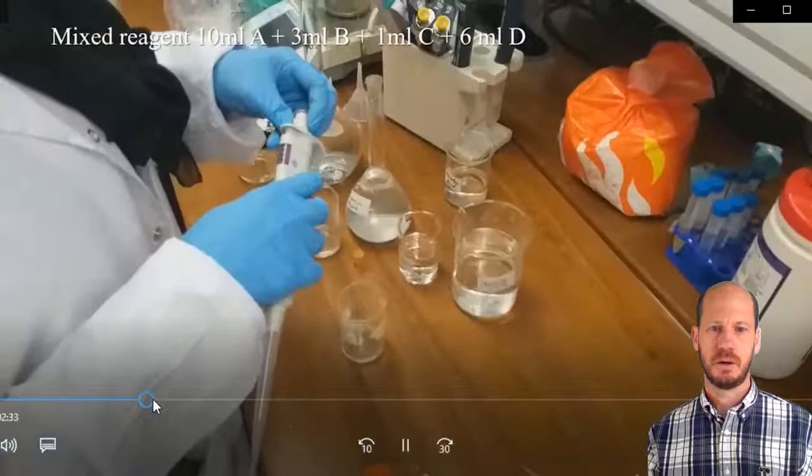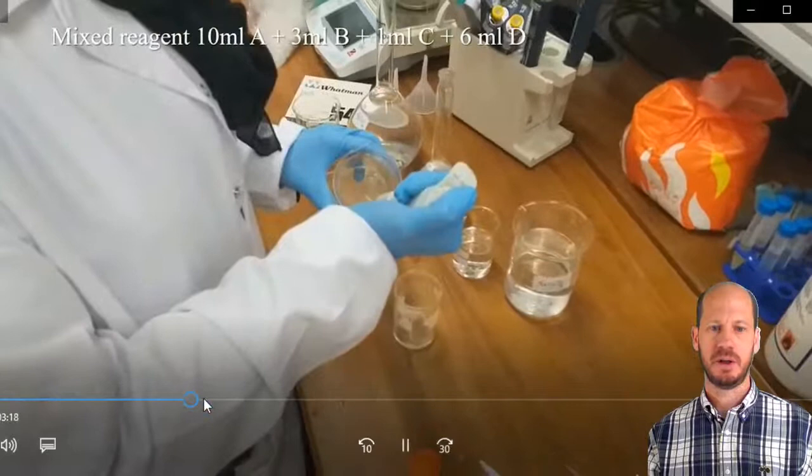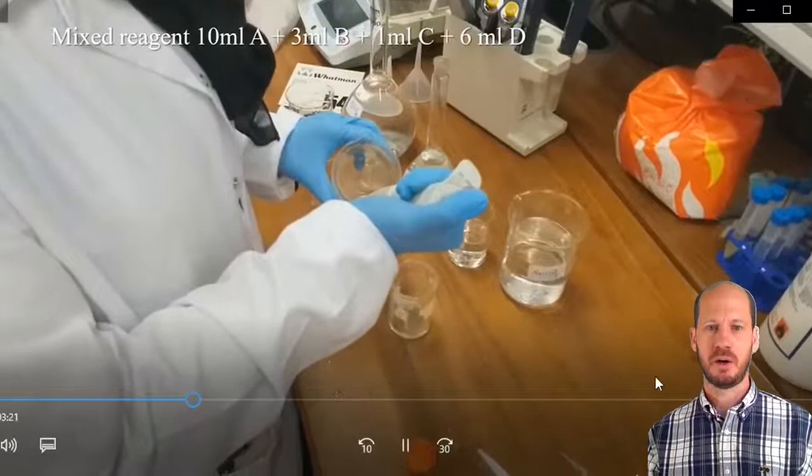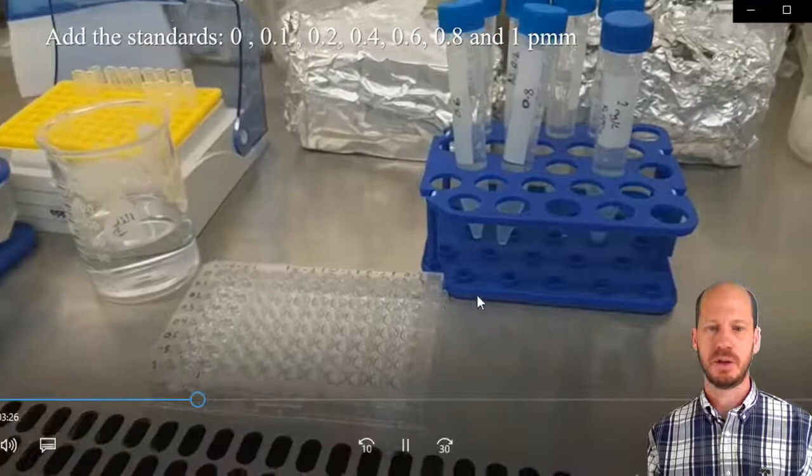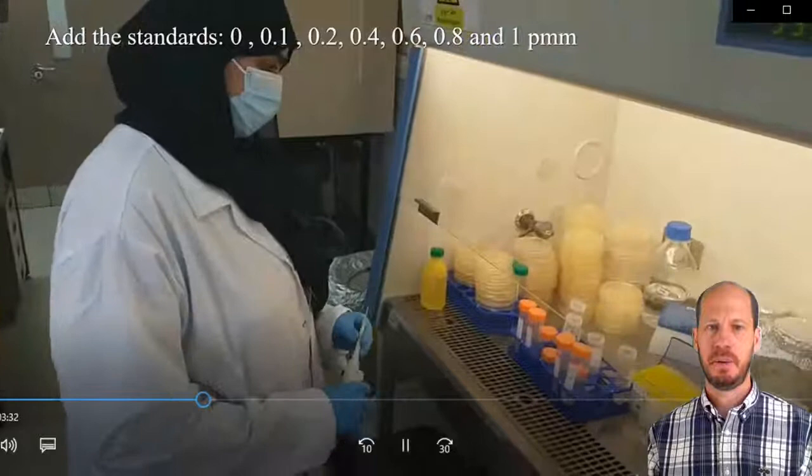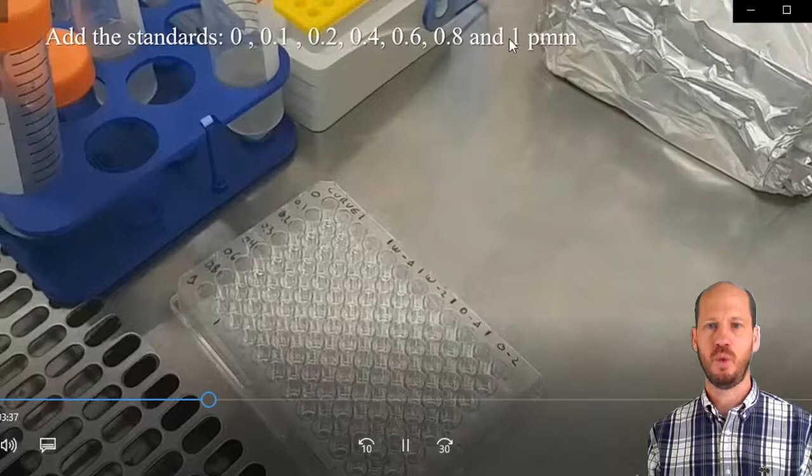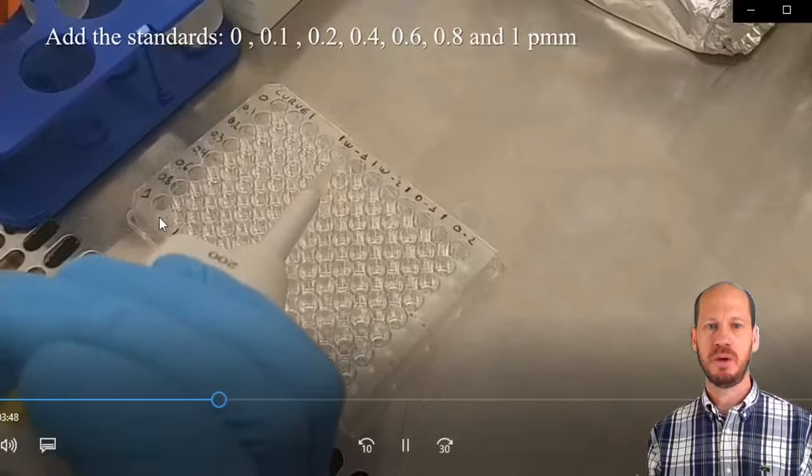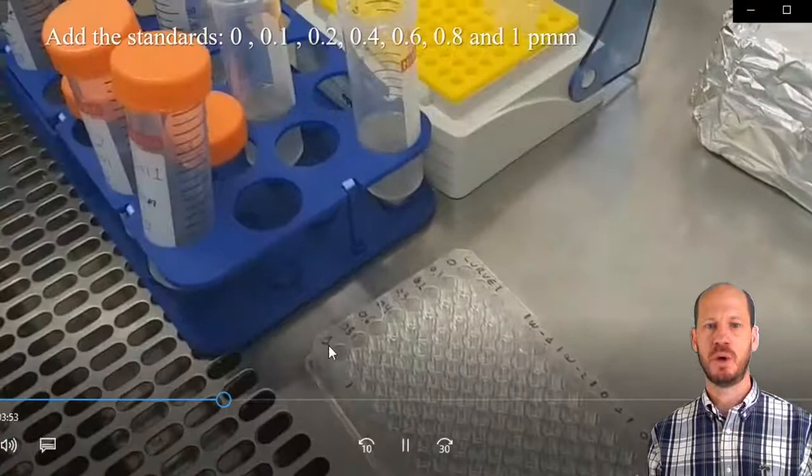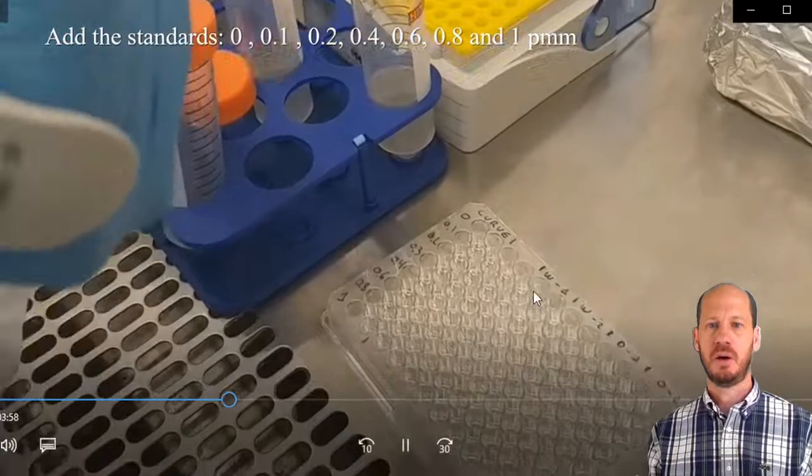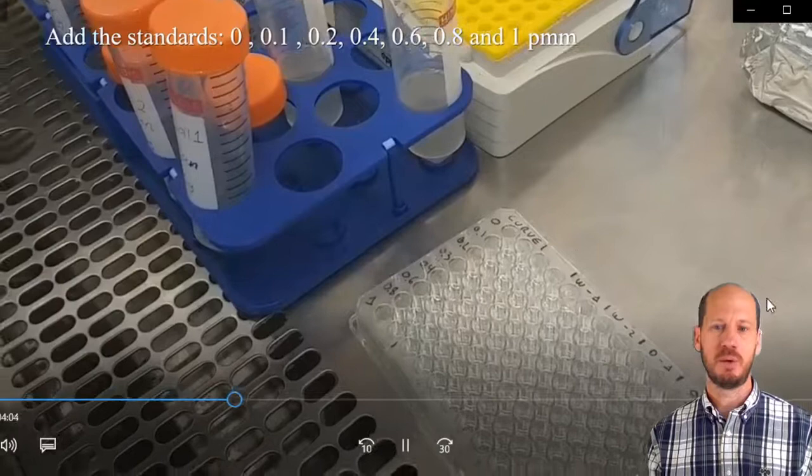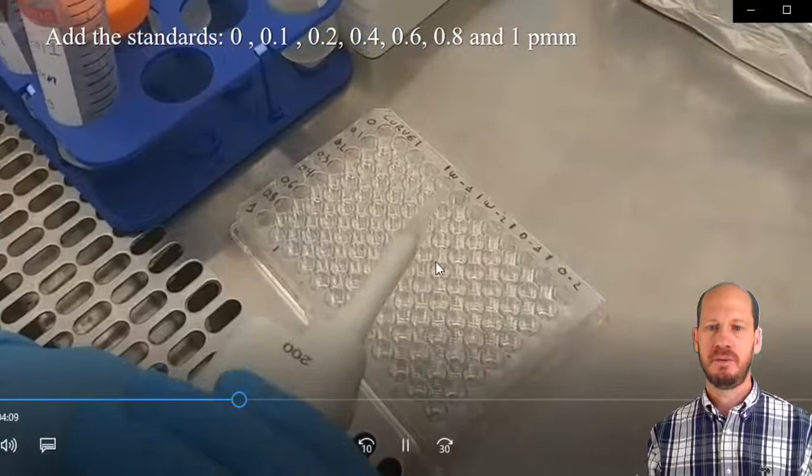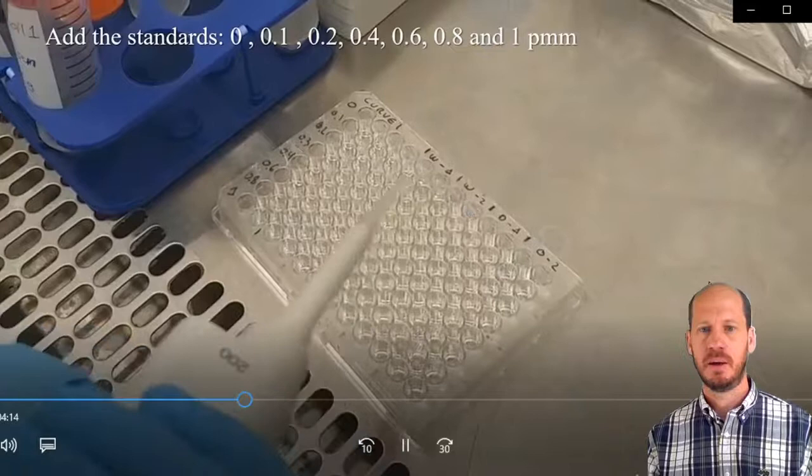Next thing is we're going to prepare our microplate. We're going to pipette our standards. The standards contain from zero up to one ppm: zero, 0.1, 0.2, 0.4, 0.6, and 0.8. We pipette them in the first two columns of the plate. It's marked zero to one ppm on the side, marked curve. We also have plenty of spaces to pipette our samples. You can place samples wherever you like on this plate, you just need to know exactly where they are.